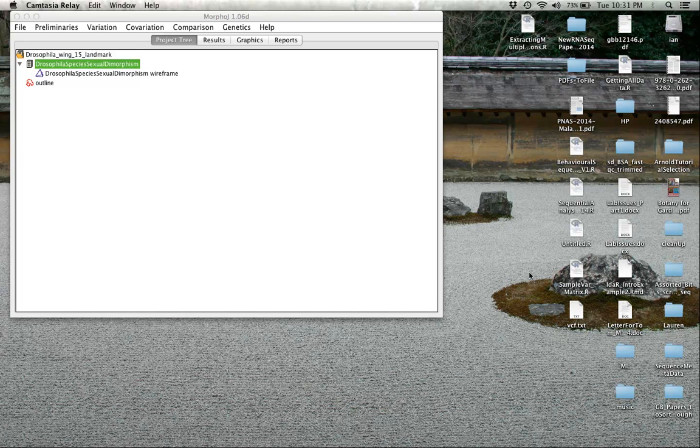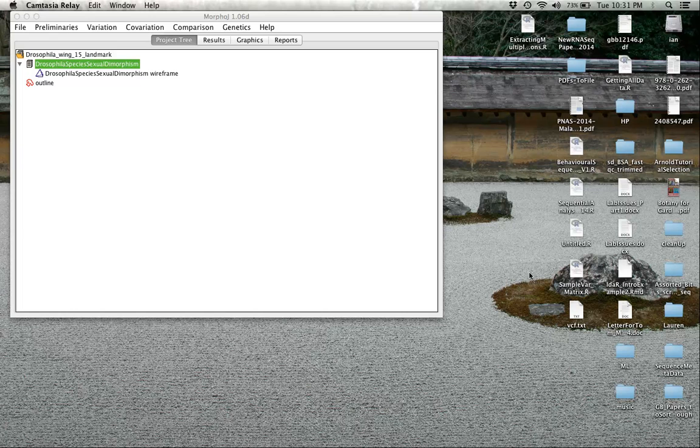But we haven't yet seen how any of this works. So what we're going to do now is do several simple analyses, in particular something called a principal components analysis, to allow us to start looking at variation in the data in a variety of different ways.